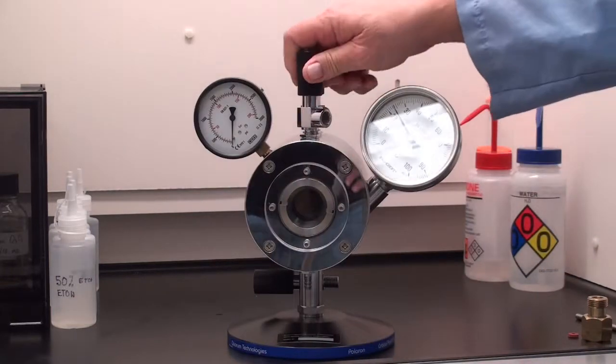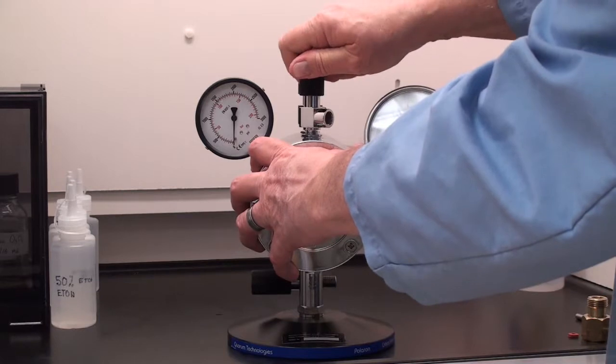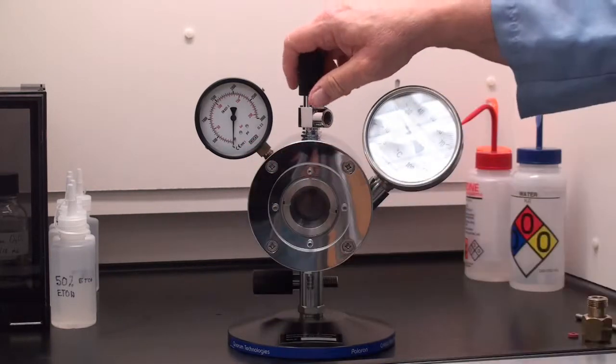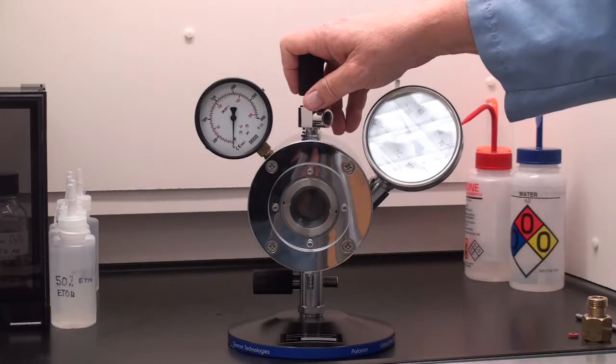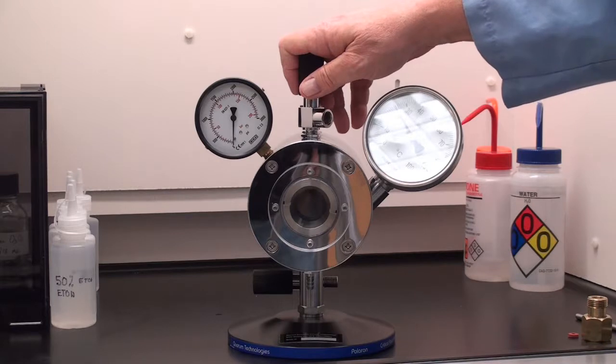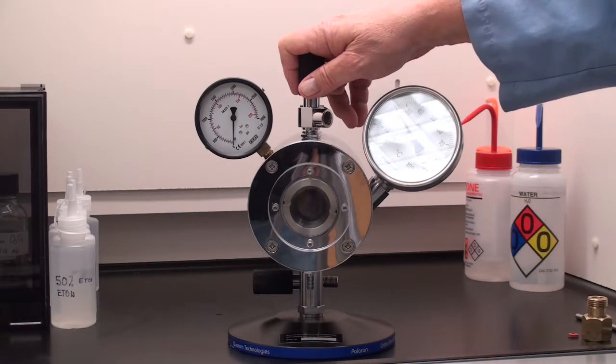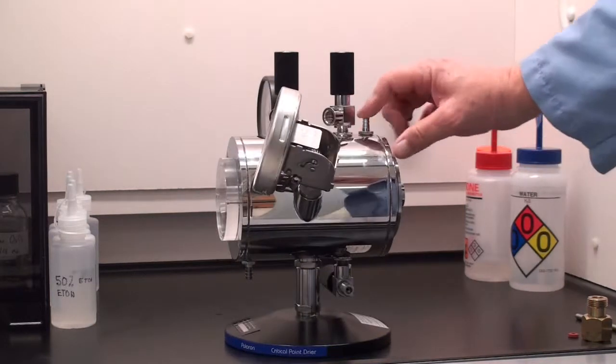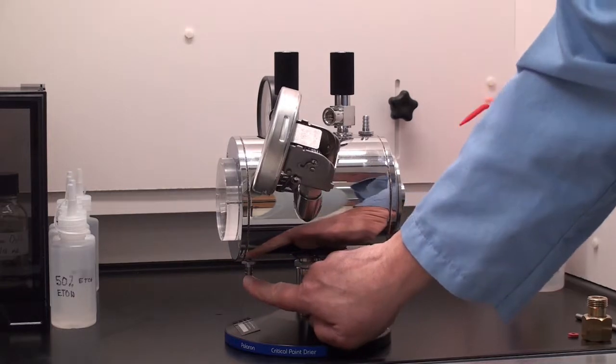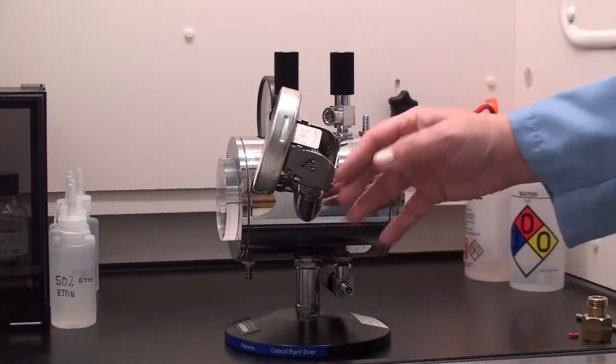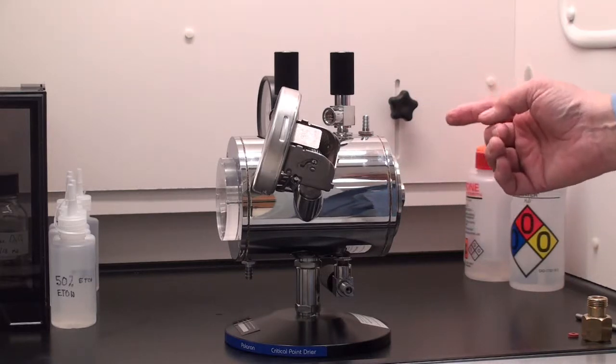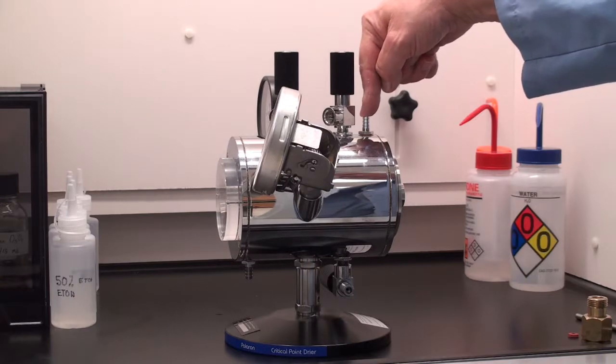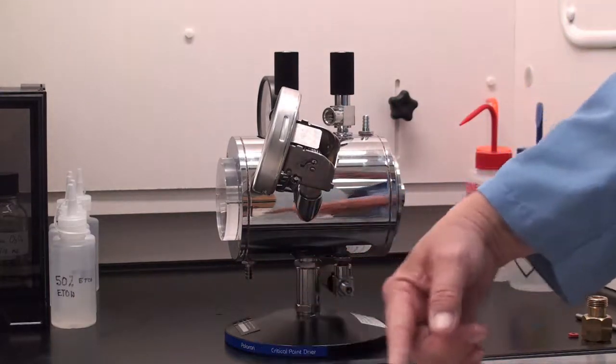All these valves are somewhat delicate. You want to open and close them without having to use any wrenches or items like that. They are very sensitive. If you just hand tighten them they will give you a long life of use. Also here and here is the water inlet for the jacket around the chamber which does all the heating and cooling. So you would plumb water in one side and take it away on the second.